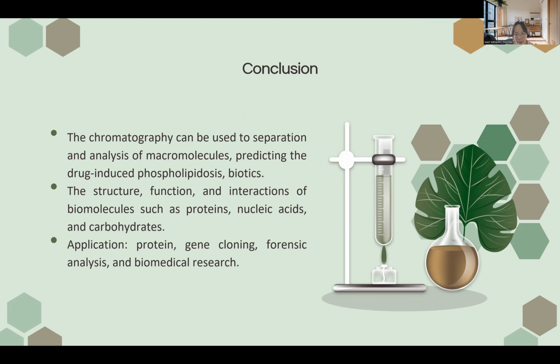This method enables researchers to study the structure, function, and interactions of biomolecules such as proteins, nucleic acids, and carbohydrates.